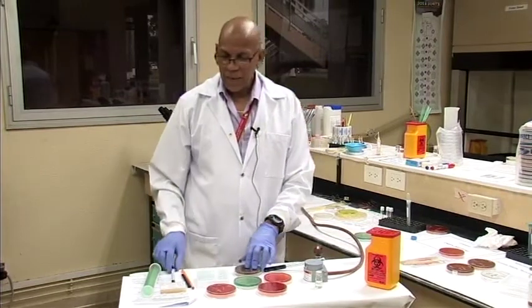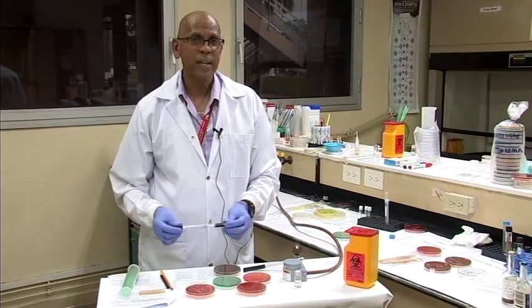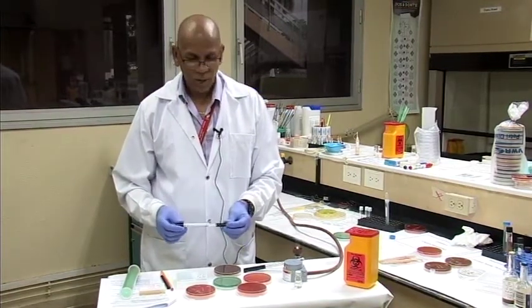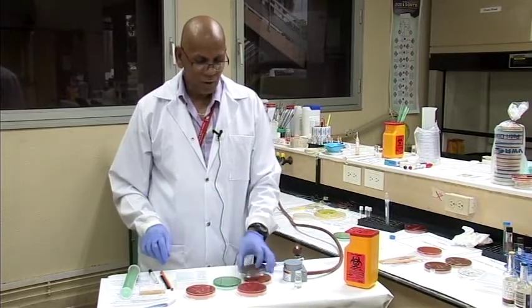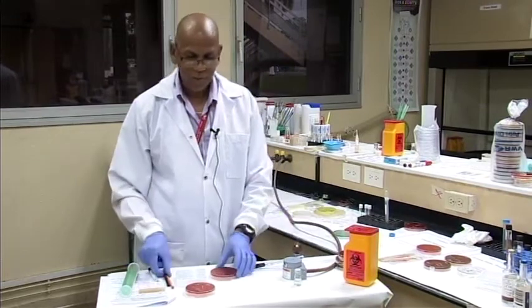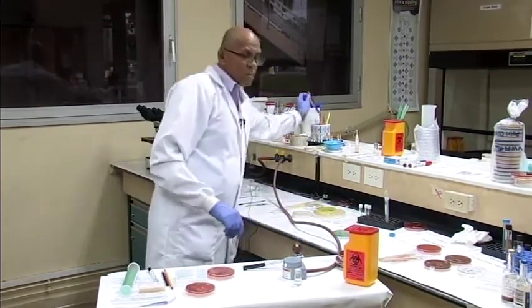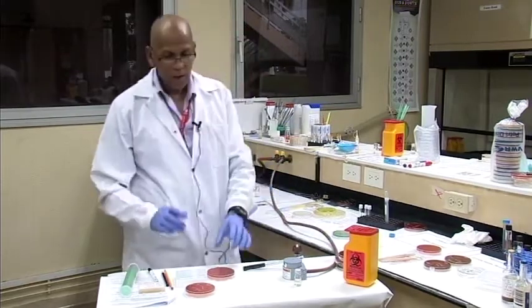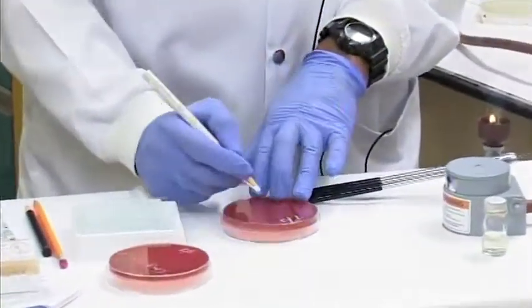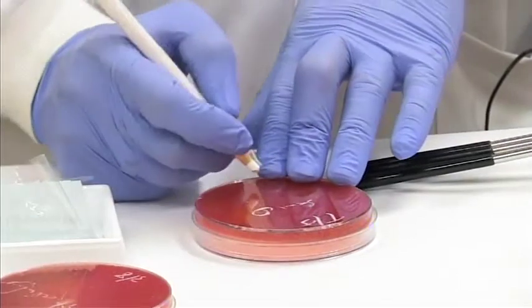So I'll demonstrate now how to do a culture using a sample of a swab. So let's say the sample came in, again, maybe a wound swab, skin swab, throat swab, and so on. In that case, all we will need is a blood agar plate for a throat swab. So I'll demonstrate, for example, a throat swab. So you'll take an agar plate, and you will label your plate. On top we normally write the specimen. So if a throat swab, we will write TS. We'll write the sample number and our date.